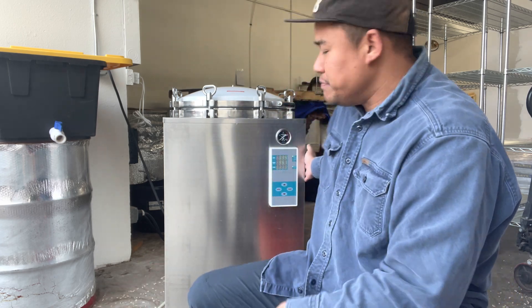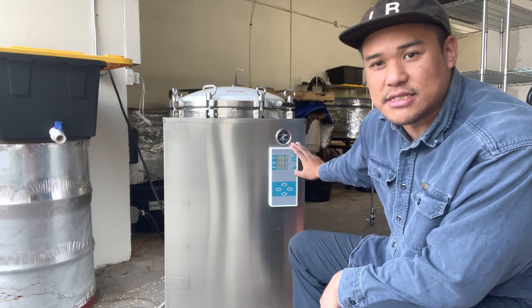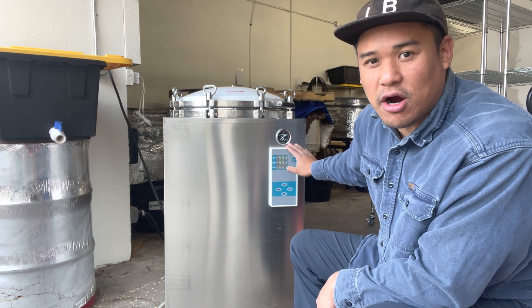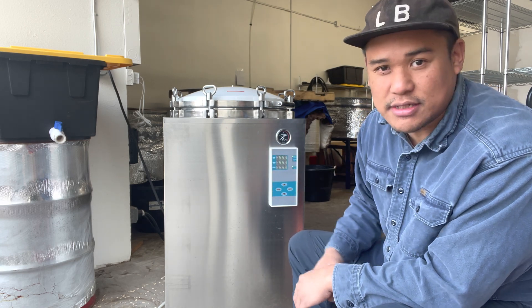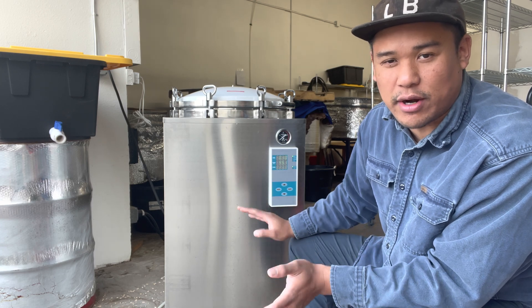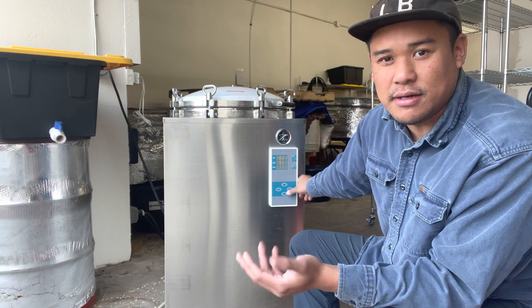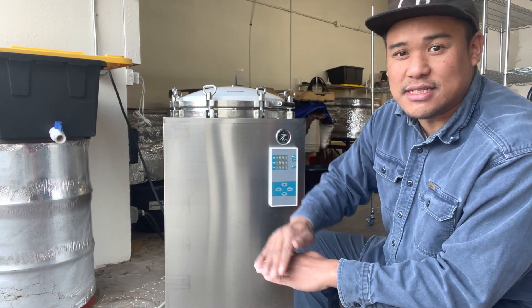The great thing about it is the control panel. The function on it is already preset - I set it for two and a half hours at 15 PSI, and it just stays there unless I want to change it. All I have to do is press a button, the settings turn on, and it kicks on once it gets to temp.